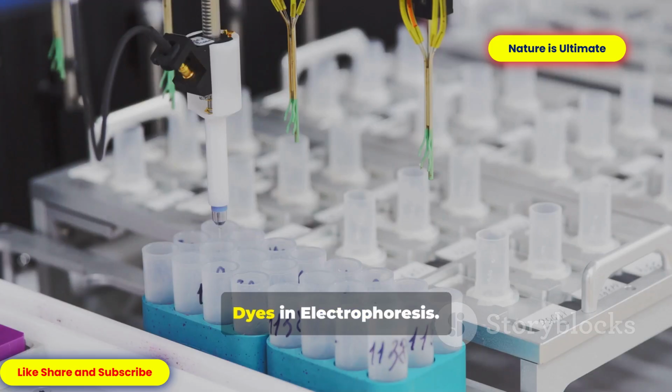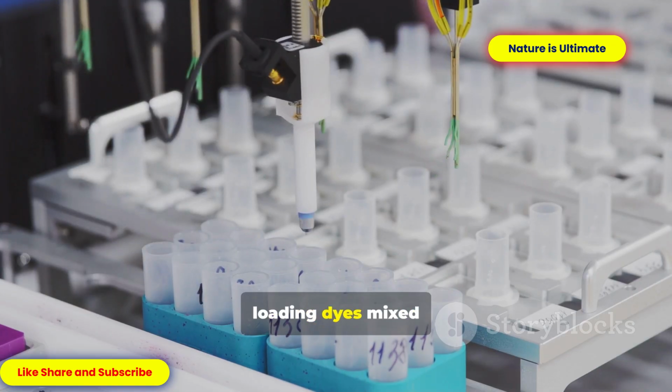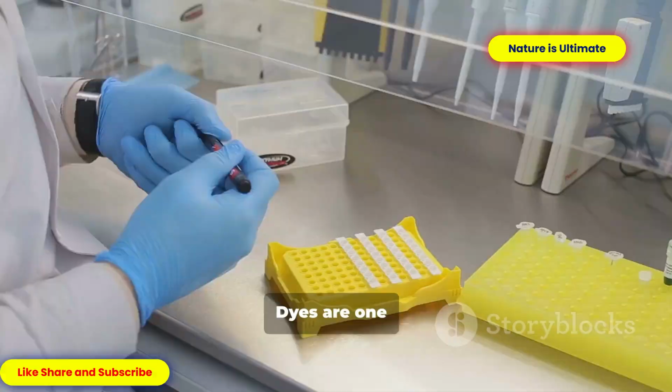Now about tracking dyes in electrophoresis. Tracking dyes are loading dyes mixed with the sample before electrophoresis. They help visualize migration during electrophoresis, estimate progress of the run, and provide density to the sample; usually glycerol or sucrose is included. Common tracking dyes are 1.